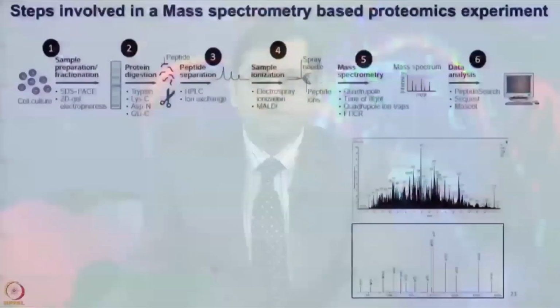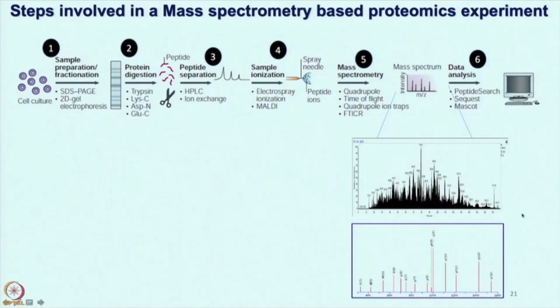Okay, so now you are familiar with how you can use different parameters and settings for the MS and MSMS analysis. After doing a good run from these experiments from the same sample, now you will see these chromatograms, which is shown here on the screen, which shows the time versus the intensity of these peptides. And as I mentioned, you would like to see a good Gaussian distribution of the peptides coming out of your sample.